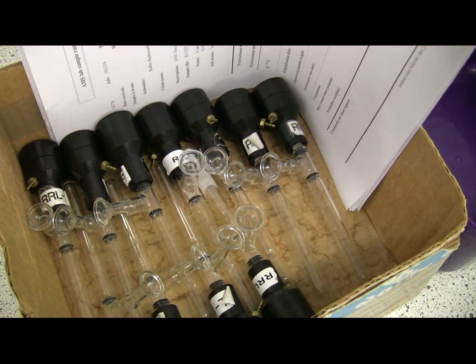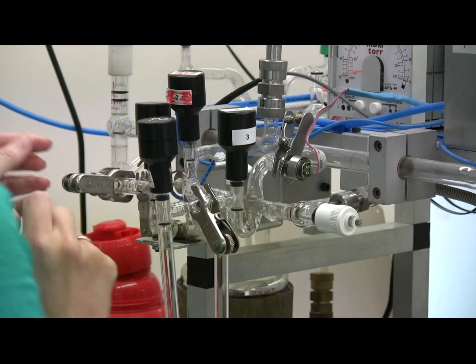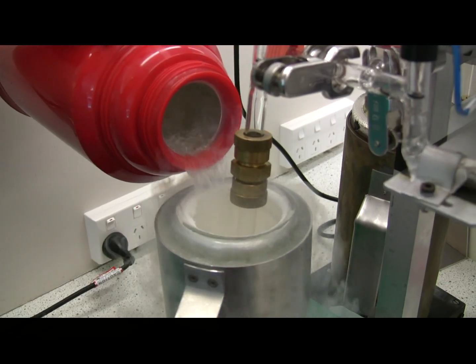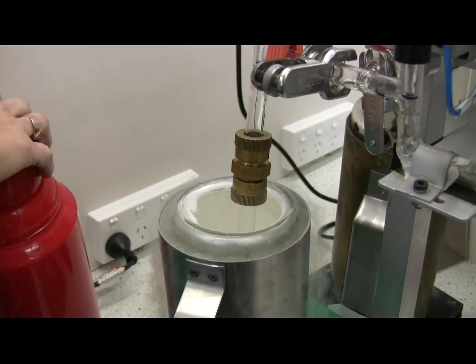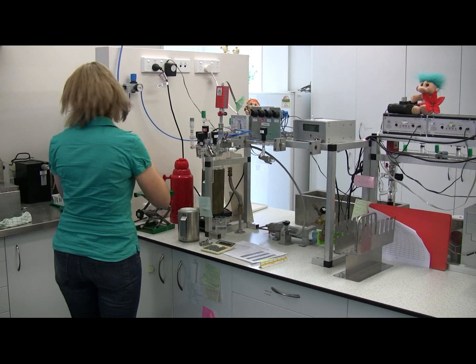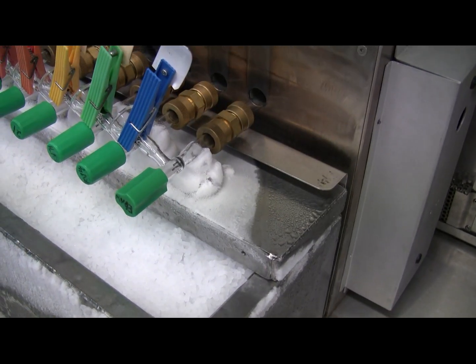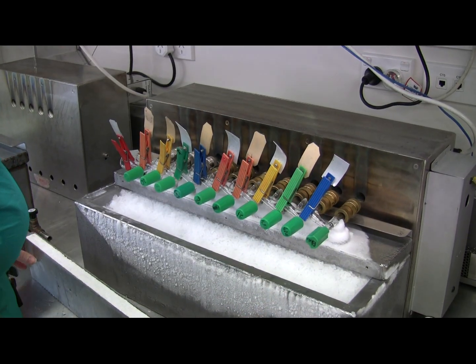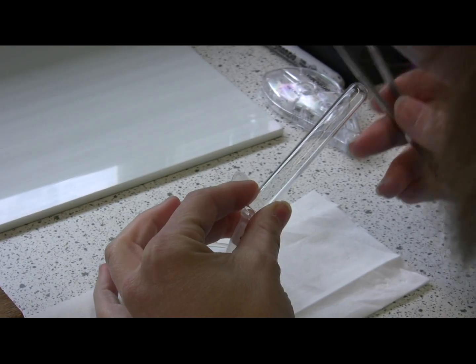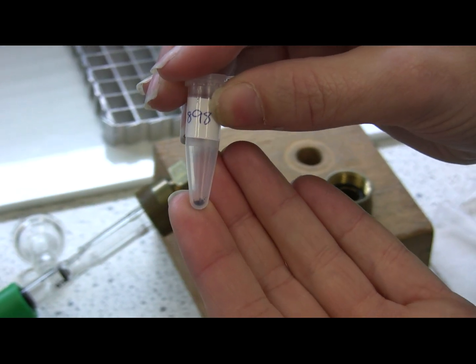The final step in the process is making graphite. What we do is attach this little bottle containing the CO2 to the vacuum line over here, and that CO2 is mixed with hydrogen inside a graphite reaction vessel. There's a small amount of iron powder inside the reaction vessel, which is what we call the catalyst. When the hydrogen and the CO2 are heated to a high temperature, the hydrogen will take the oxygens off the CO2 and deposit elemental carbon in the form of graphite on the iron catalyst. A tiny amount of graphite is the end product from the sample preparation laboratory.